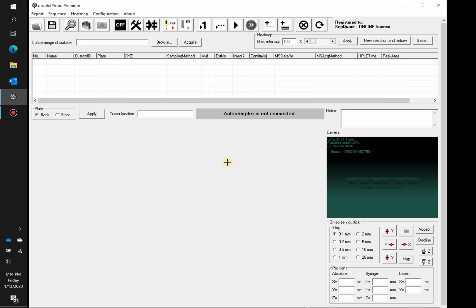So I'd like to get started on the software portion of the video. And this is one of those things where I could talk a lot about this software. I don't want to make people fall asleep, but also I don't want to make this an hour-long video just on software. So the point here is there's a lot of flexibility in this software. There's a whole section on heat maps, which I will probably make a second video on.